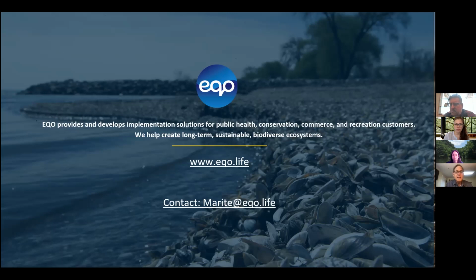If I could just add to that, John, in our previous work on hydrocarbon detection, DNA and RNA are often extremely sensitive because you can detect things just when they're beginning to be expressed. And so in this case, again, as John said, we don't know, but the methods we're using are able to detect at very sensitive levels of toxins, sometimes maybe even before other methods.